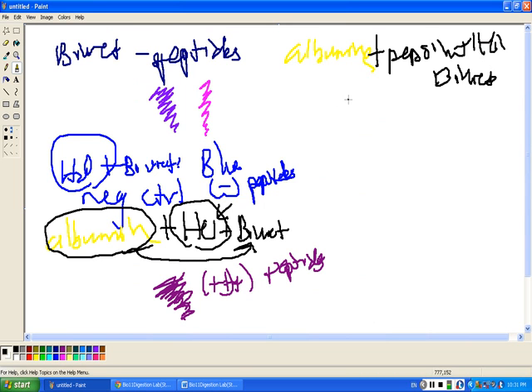Okay, so doing this, what is pepsin? Pepsin is a protease, so it's an enzyme that breaks down proteins. We just mentioned how egg whites contain a lot of proteins. Where is pepsin found? Pepsin is found in the stomach, and this enzyme works best at low pH, hence the HCl. Remember, HCl is also produced by the stomach. So pepsin works best at low pH, which is the HCl, so it will end up digesting the albumin.